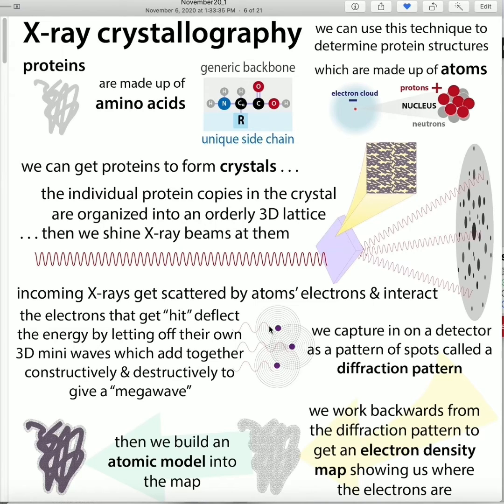But when you make the models, you're trying to put a pinpoint in the center, where the nucleus would be, but what you're actually seeing is the signal from the electrons. Because electrons are in this cloud, and because of the resolution you can get, it's kind of fuzzy, so you end up getting this meshy thing called an electron density map. But you don't get that electron density map either when you get your data. Instead, what you get is the diffraction pattern.